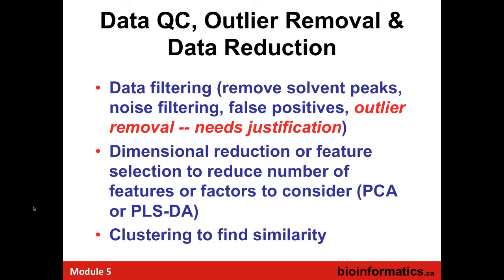No, it is certainly possible. And when you've got 6%, that's legitimate, and you can use that as a biomarker. And obviously, you'd like to try and make your assay over time a little more sensitive. But if that's an effective biomarker or part of an effective biomarker panel at 94%, having something below the limit of detection and then giving it a value of half that is completely legitimate to include as a biomarker.